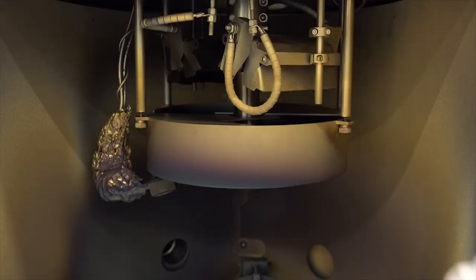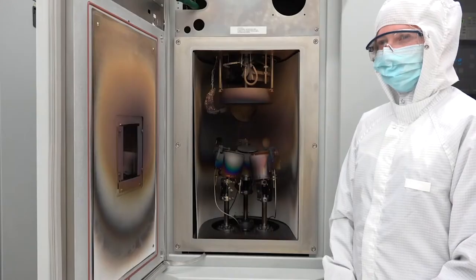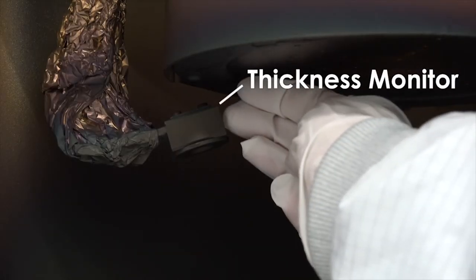The next component is the sample or substrate holder, located at the top of the chamber. This is where we put our substrate or sample that we will sputter deposit a thin film onto. Here's the thickness monitor, which measures the thickness of the material being deposited in real time.